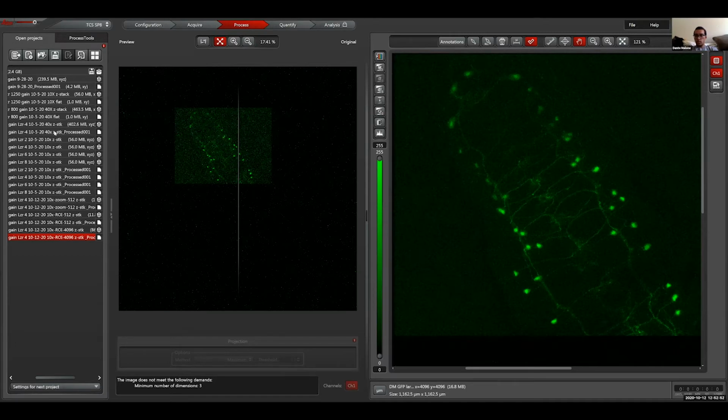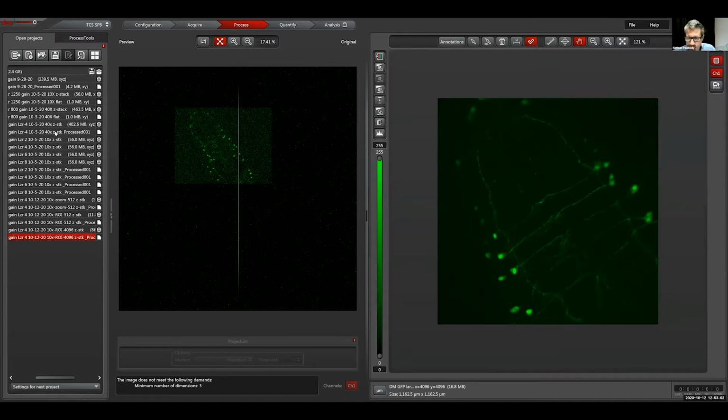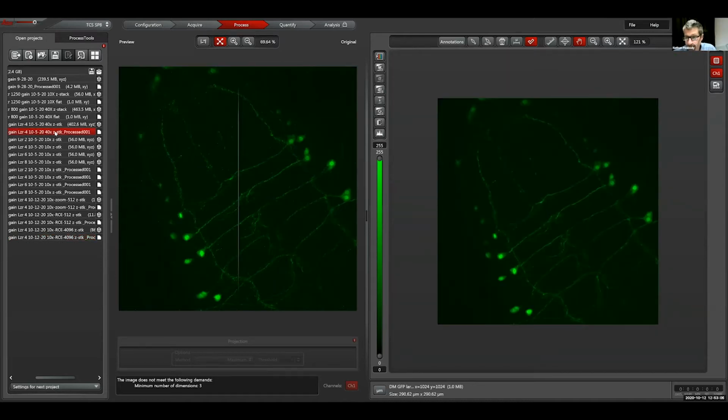It's a different actual animal because I made a slide for 40x which has oil on it. So it'll be a different animal, but you should still be able to compare it. So let's compare it to this one. Yeah, definitely a lot more clear.